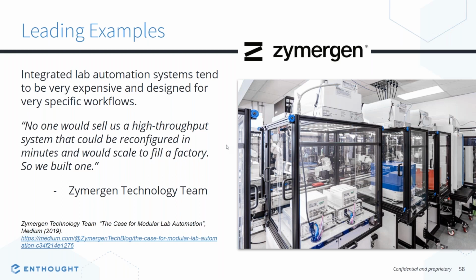And you can see here they've prioritized and approached things a little bit differently than we saw in the Evonik example and in other players in the coatings industry, where they've placed a premium on flexibility and modularity. They want things that are reconfigurable. It's a different way of designing automation systems that enables them to do some really interesting things and be more dynamic in their product development.